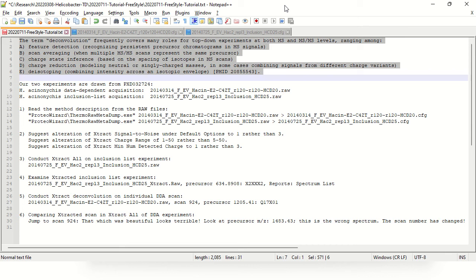So for every B ion, we predict a single charged version and a doubly charged version. In a +2 spectrum, we don't do that. We just predict that each fragment ion would be singly charged. So we're doing something very differently when it comes to top-down proteomics, and that's because there's a very wide range of charges at which we would expect to see a given fragment ion.